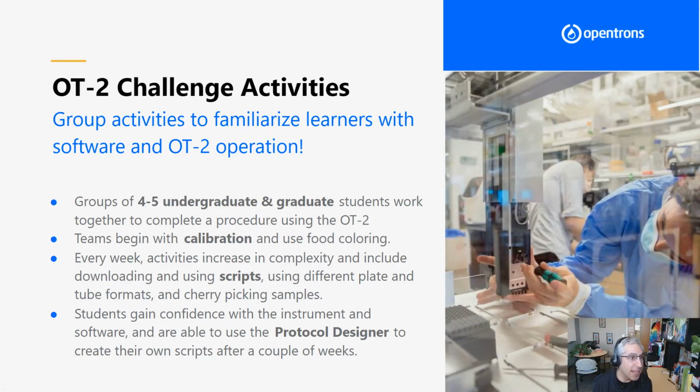and the software and calibrating it. And then by the end of a couple of weeks, they were able to use the protocol designer from OpenTrons to create their own scripts. And thanks to Jonathan Lamb's help from Zymo and graciously sharing how they approach automation of kits, sharing some of the plate layouts and some of the reagents and racks, how they set them up.